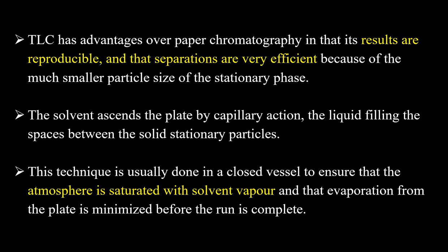When we close the vessel, saturation of the solvent system takes place due to the vaporization of the organic component present in the solvent, and evaporation from the plate is minimized before the run is complete.